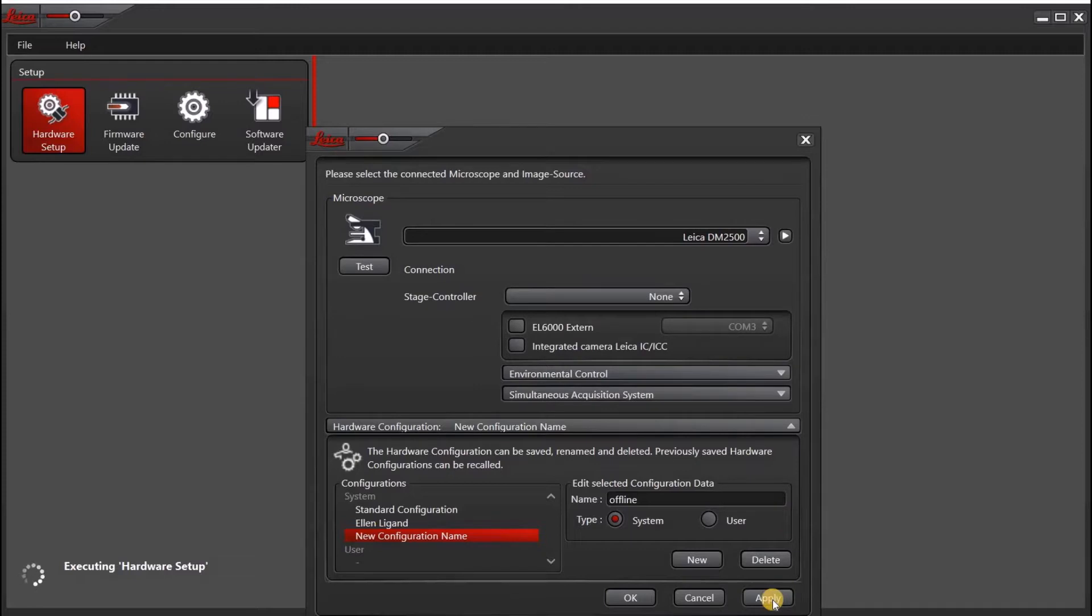Then click apply. And now your offline configuration will appear under systems.